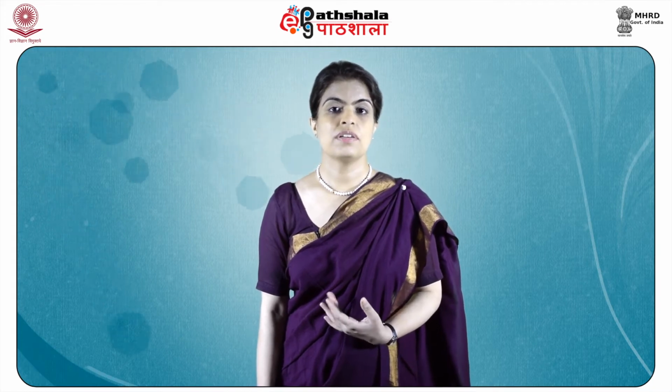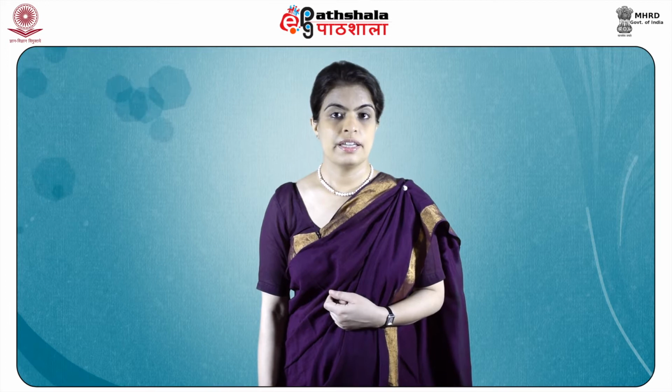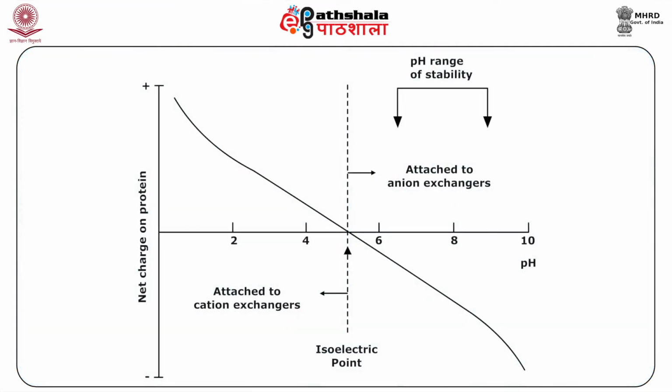The very first choice to be made when performing ion exchange chromatography is to decide whether to use an anionic or cationic exchanger. In case of a mixture of proteins, the net charge on the protein will determine whether they will bind to an exchanger or not. The net charge on a protein depends on the pH. Hence, knowing the stability of the proteins in the sample mix at the pH being used in an experiment is very important. Proteins are stable over specific pH ranges. If a protein is stable at a pH which is above its isoelectric pH, that is its pI, then it will be negatively charged. A protein that is stable below its pI will be positively charged. The former will bind to an anion exchanger, while the latter will bind to a cation exchanger.